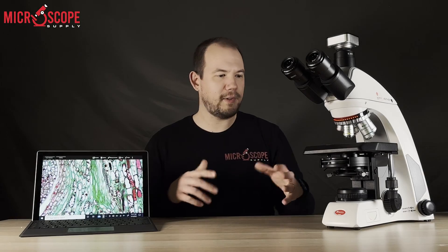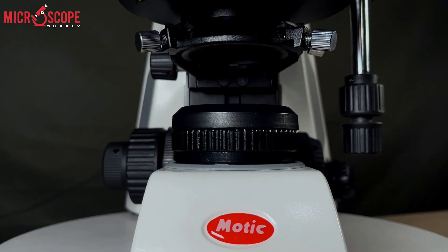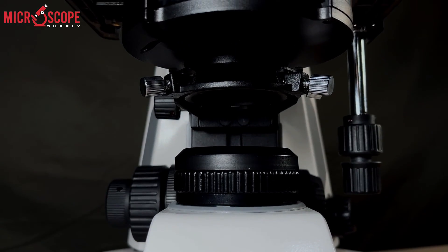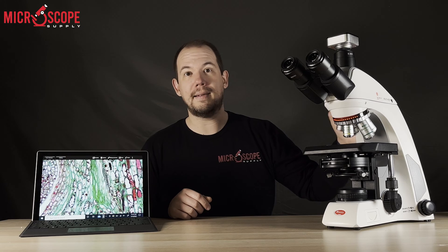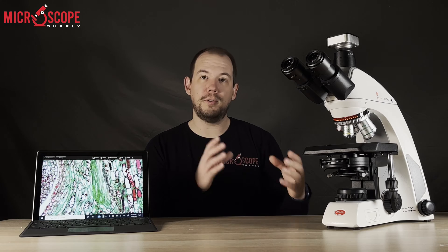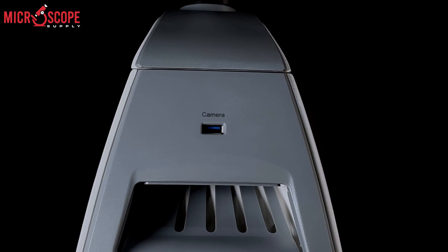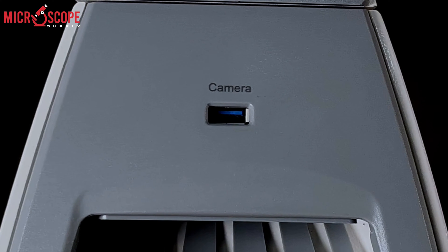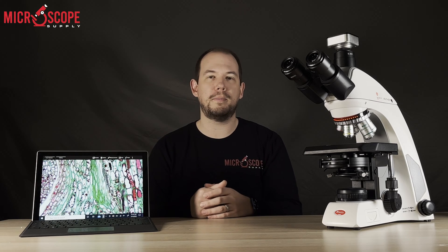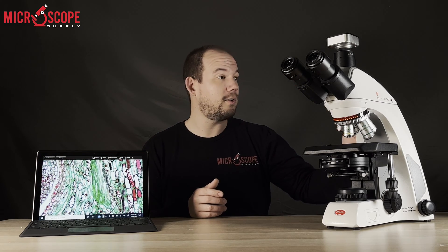Every C2 comes standard with an adjustable field diaphragm. If you want to set Köhler illumination, an adjustable field iris diaphragm is necessary. On the back of the C2 there is a USB 2 output to provide power to external cameras that require it, as well as the interface — whether USB 2 or USB 3 — so instead of running a cable out to an outlet, you can power the camera from this port in the back.